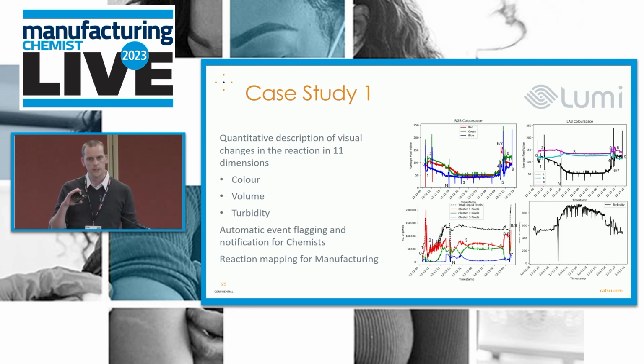So you can take, looking at it as a whole, so this is just the summary of all the data. You wouldn't take it in that domain because each domain is separate. Each time domain is separate because you're carrying out a different process. But what you can do then is start to describe the reaction in a much more quantitative way than you could before. So instead of a biphasic mixture with a red layer and a clear layer, we now have the volumes, we have the colors, we have the turbidity of those different layers, all described, and then comparison between batches can be carried out to show the changes.